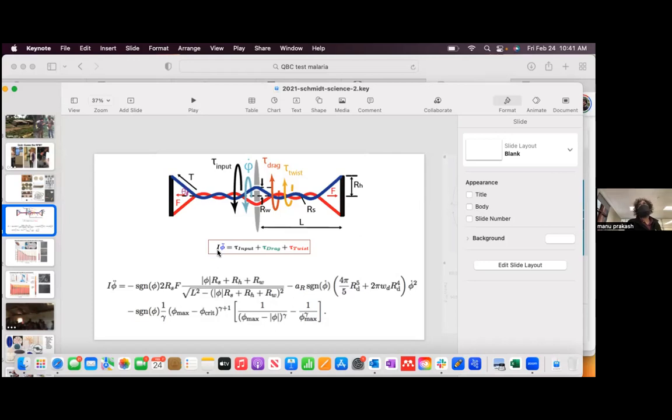And actually the other part of that is, in this scenario, when you think about accelerations, the accelerations are increasing and decreasing because there is a moment of time that you actually don't see where the centrifuge is perfectly stationary, because the inertia winds it and it has to go from clockwise to anti-clockwise.